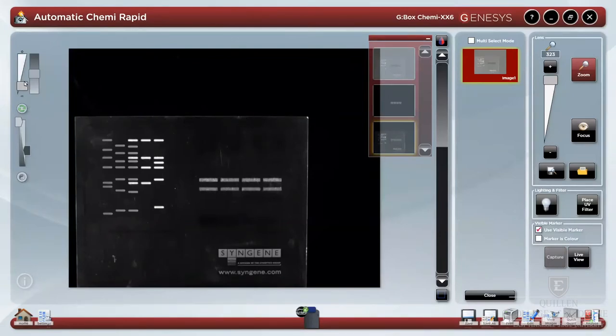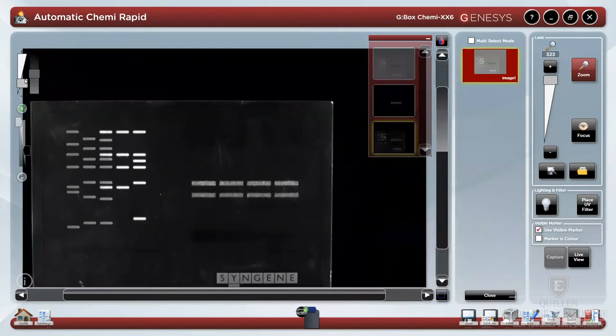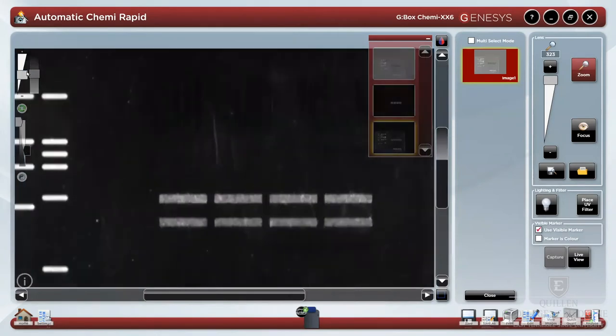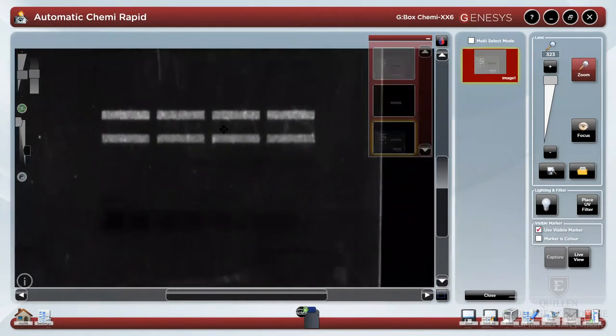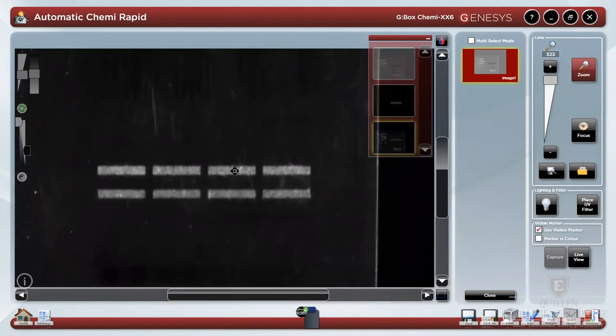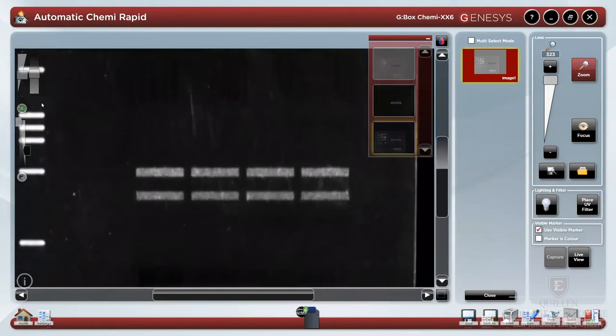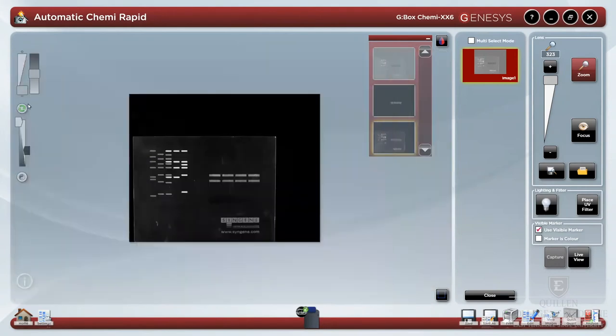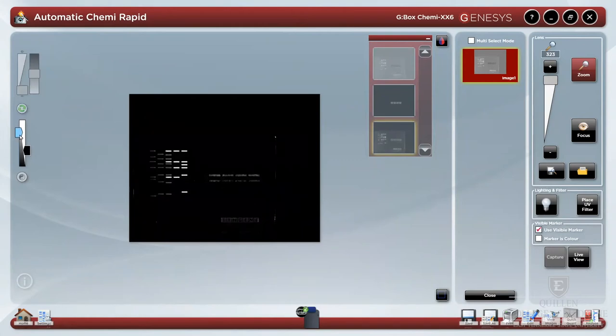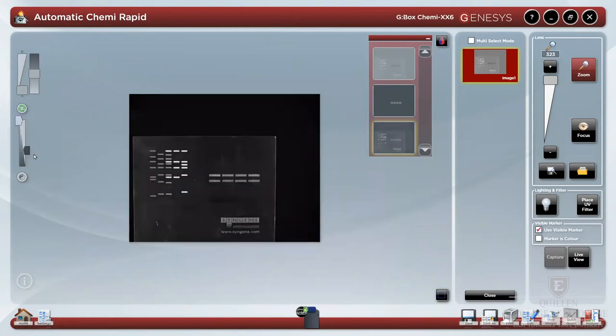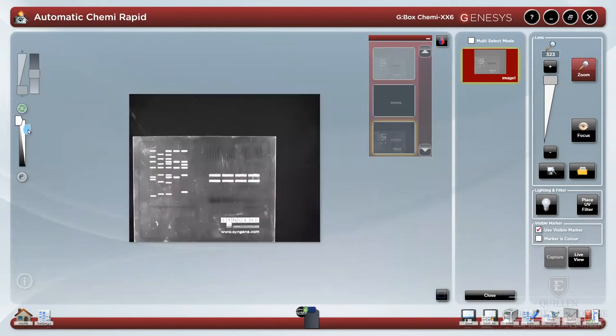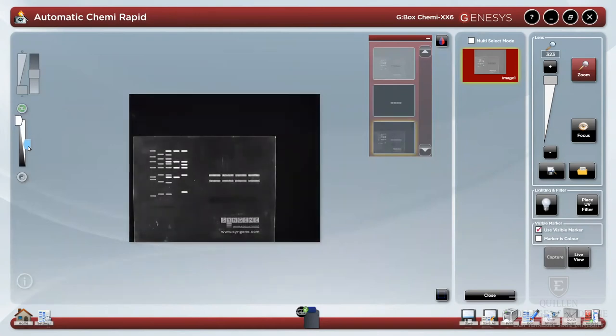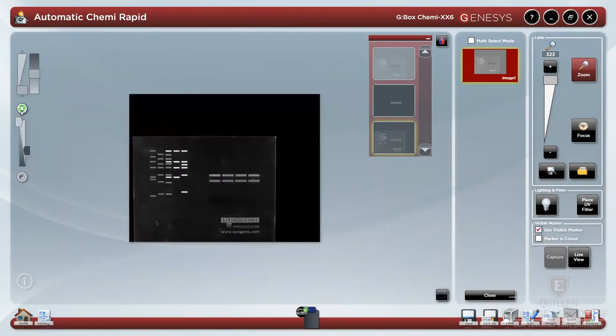Sliding bars to the left-hand side of the screen can be used to zoom in, pan around your image to see things in detail, and then zoom back out. Other sliding bars can be used to adjust the white point or the black point to accurately affect both brightness and contrast.